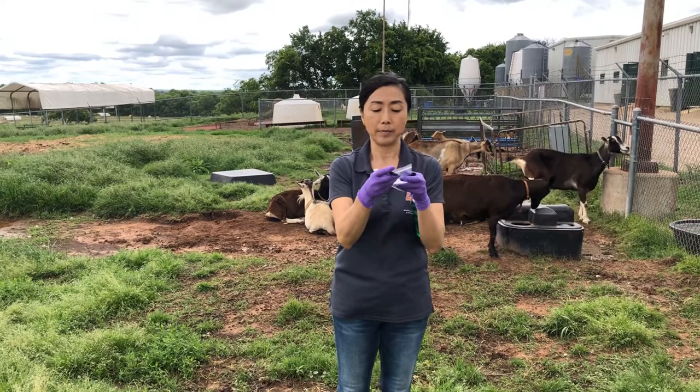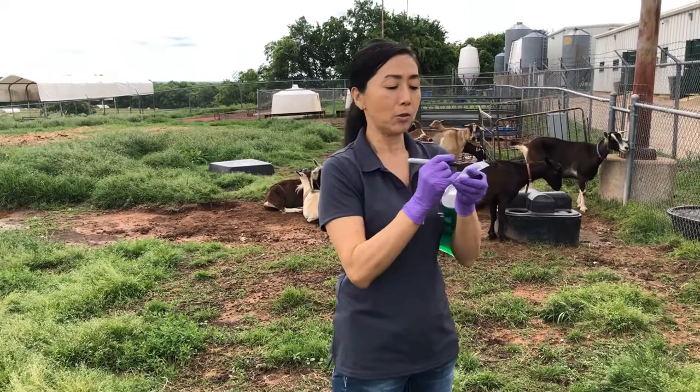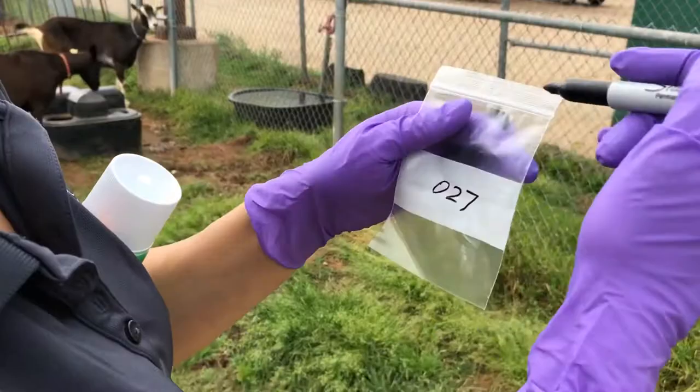I'm going to collect from — we should pick one — 027. So I will write down 027 right here. Let's get to 027.